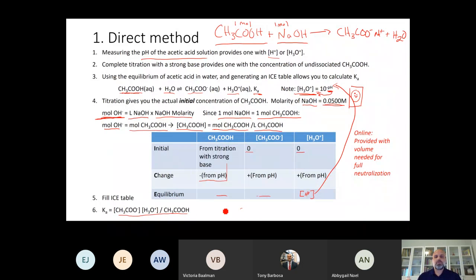So you'll be able to work through that, right? And then obviously the concentration that we start with of the acetic acid, we know how much acetic acid we have based on this calculation here, right? So we're able to calculate the concentration of acetic acid here.